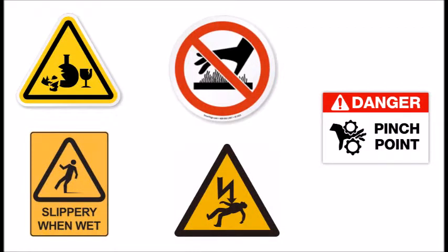There are various hazards present in this lab. The first is a broken glassware hazard. If any glass breaks, wear gloves and carefully collect the broken pieces and dispose of those pieces in a broken glassware container. The second hazard is a liquid spill hazard. If a liquid spill were to occur, turn off or control the source of the spill and wipe up small spills with a paper towel. In case of a large spill, mop up and set up a wet floor sign.